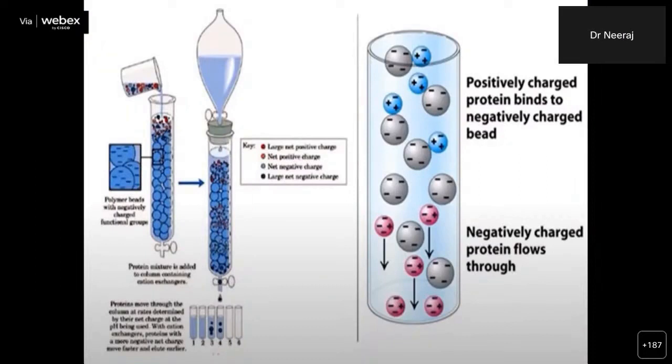So this is the diagram showing it. You can see here the mixture is present in this beaker. This is the column. In the column, you can see carboxymethyl cellulose solution is there. Now you will pour it.